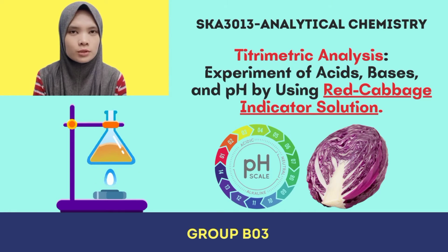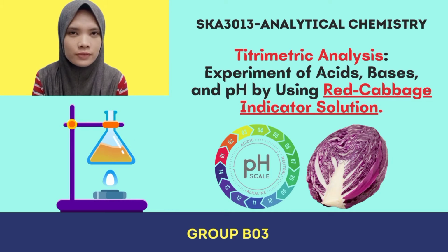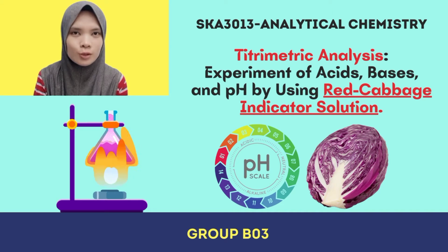Today we from Group 3 will present an experiment related to the topic of titrimetric analysis. The title is Experiments of Acids, Bases and pH by using Red-Cabbage indicator solution.